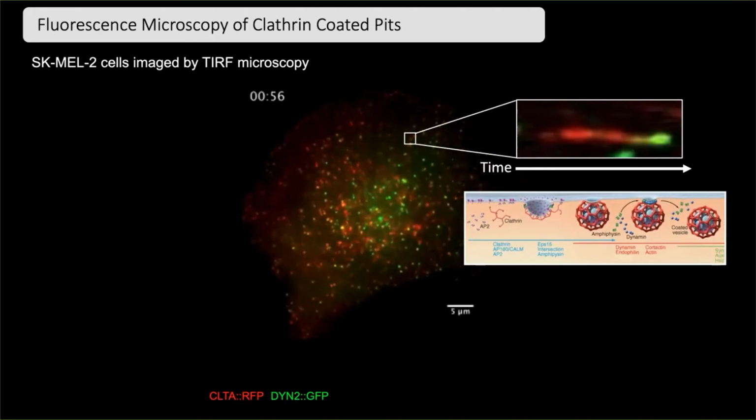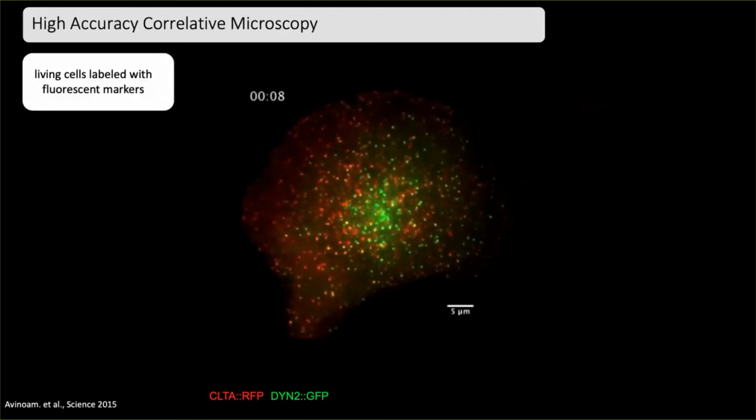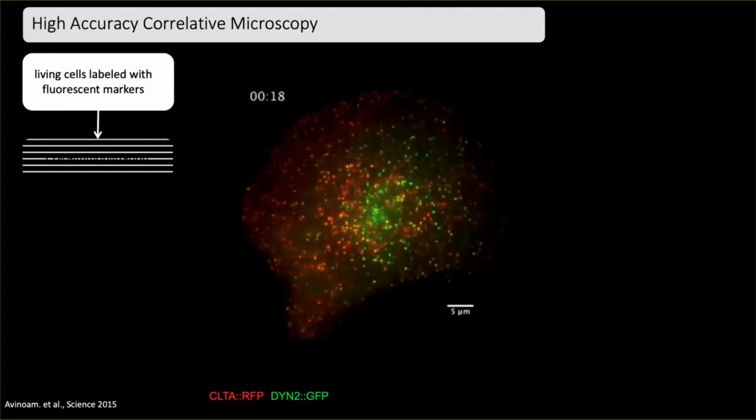So because I know my fluorescent signal, I can already confidently say that I have to go through cryoimmobilization in order to maintain my fluorescent signal, irrespective of whether I image after I have immobilized only, or if I proceed with the processing of the sample. Because cryoimmobilization is also very useful for preserving protein structure, it is also preserving the fluorophore structure.